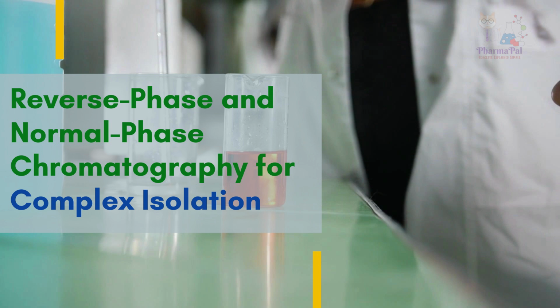Next, we need to isolate acetaminophen and caffeine from the aqueous layer. We can adjust the pH to help separate these two compounds. Step 4. Acidify the aqueous layer. Adding an acid like hydrochloric acid will protonate caffeine, making it more soluble in the aqueous layer, while acetaminophen, being neutral, remains less soluble and can be extracted into an organic solvent.